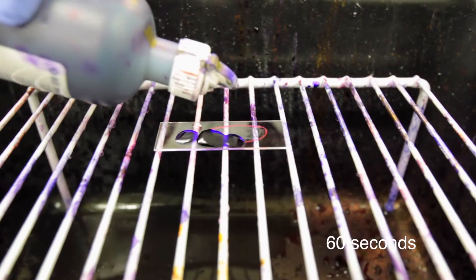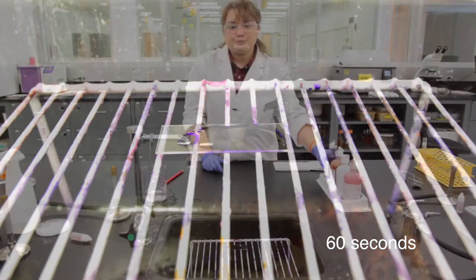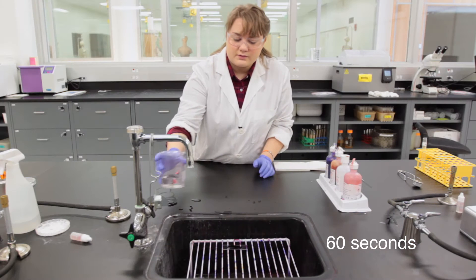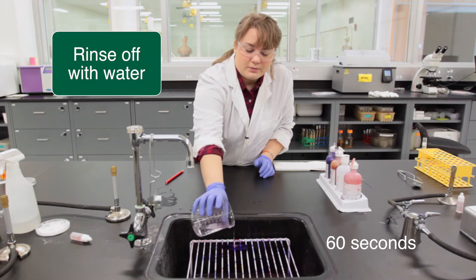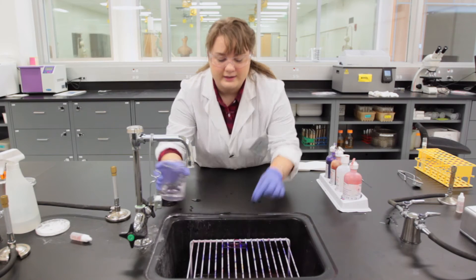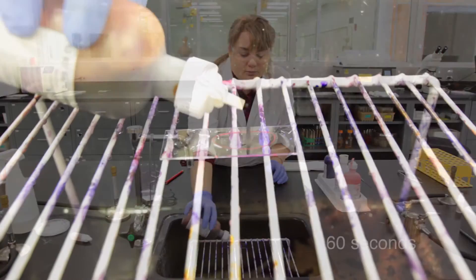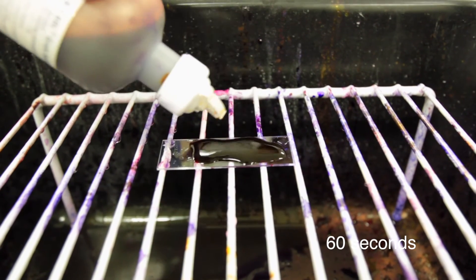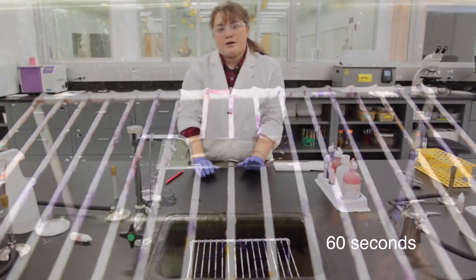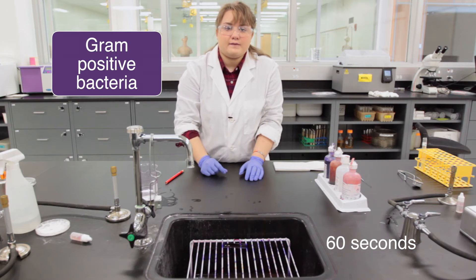Crystal violet goes on for one minute and is our primary stain. Following that one minute, rinse off the slide and add the iodine, which is the mordant. It is left on for one minute and forms a complex with the crystal violet, getting stuck in the thick peptidoglycan layer of the gram-positive bacteria.